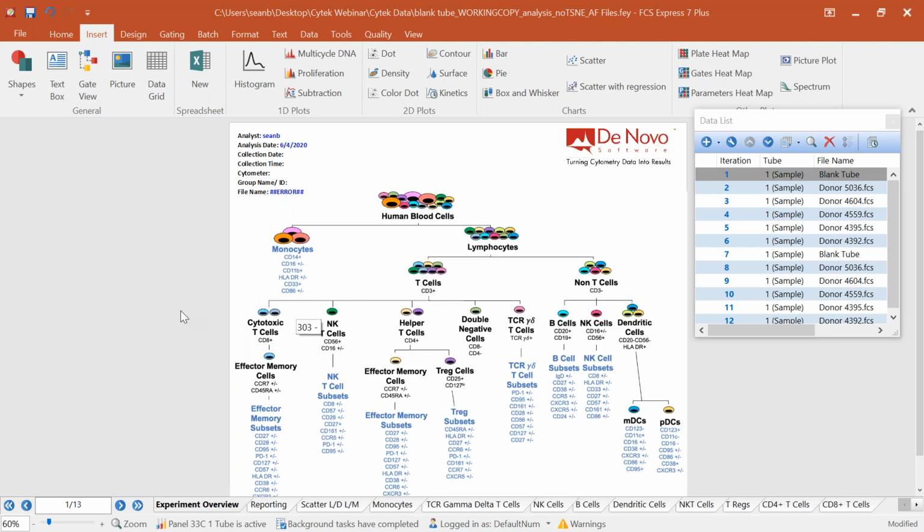And in what we call a layout that we put together, the first page here is an experiment overview. And this is just essentially a big image, right? And it's showing us what we're going to be analyzing today. But it is a very powerful tool, right? Anybody who opens up this panel, who's going to look at this data in this kind of classical panel format, they're going to know what you're looking for before you even move on to anything else.